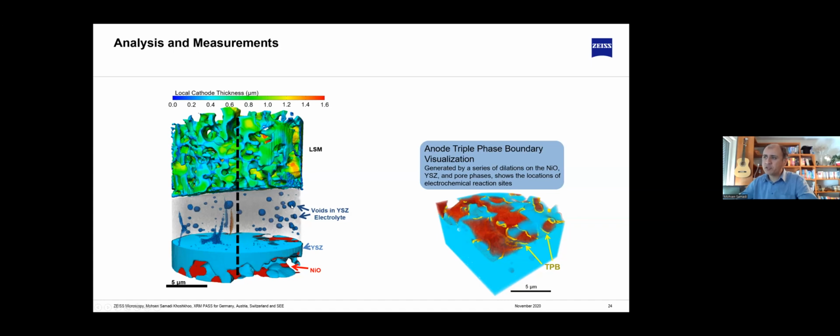Imagine you start from this void or these cracks. You can easily take your Ultra dataset to your Crossbeam Laser. You place that plane of interest for the lamella with coordinates, introduce it after registration to your Crossbeam Laser, and you get your lamella exactly where you want it. That's a huge help, because if you try to prepare the TEM lamella without having virtual information over the volume, it's impossible, since you only see the surface under the Crossbeam.